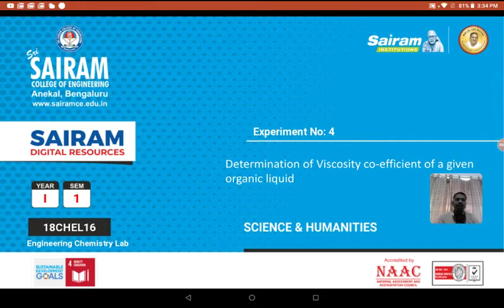We have water, we have alcohol, we have benzene, we have toluene. Isn't it? So each and every liquid or solvent has a different density. Each and every liquid or solvent has a viscosity. So let us today determine the viscosity coefficient of a given organic liquid.